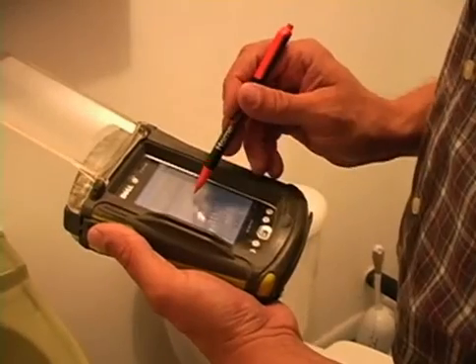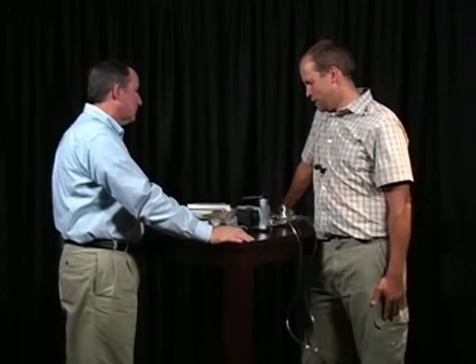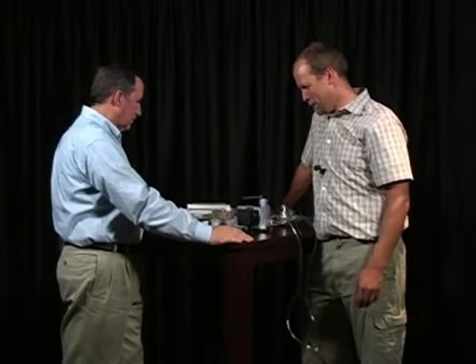Now, what about personal protection when taking all these different samples? Air samples, you're not touching any mold, so you're not causing problems. If you're doing a tape sample, like you just demonstrated, you're touching the apparent visible mold growth, and maybe you're disturbing the area.